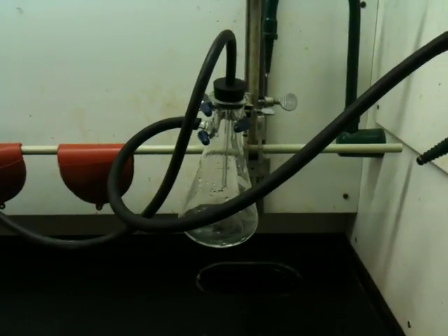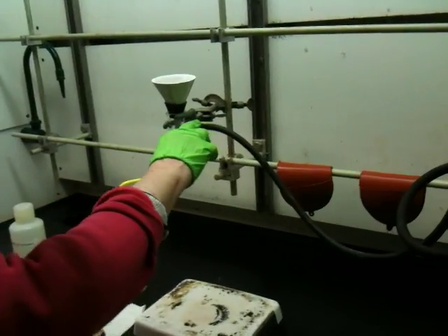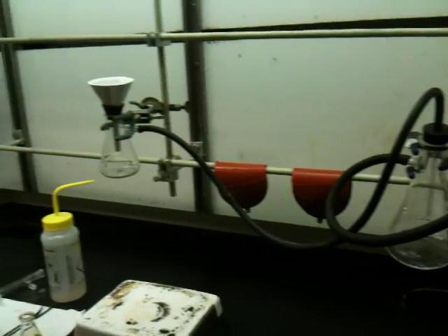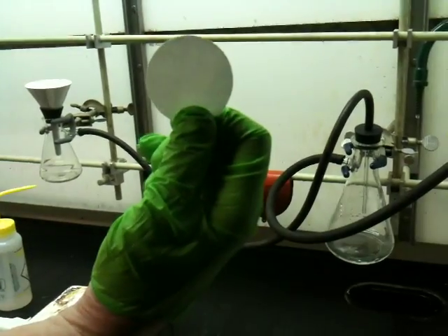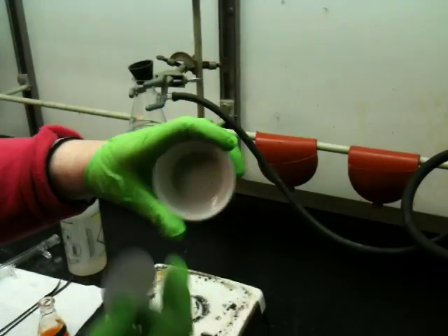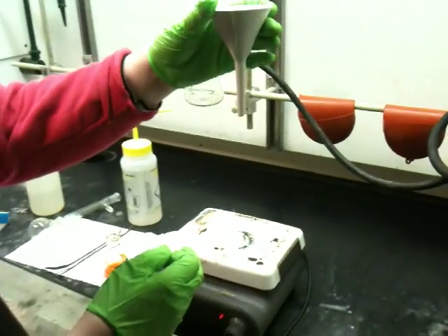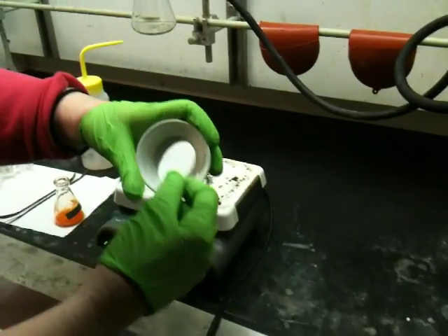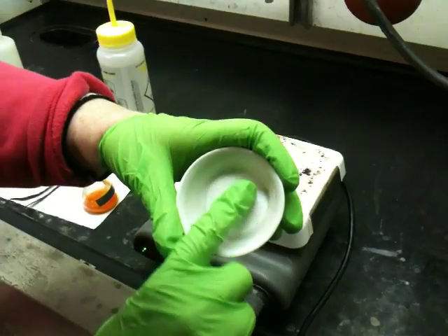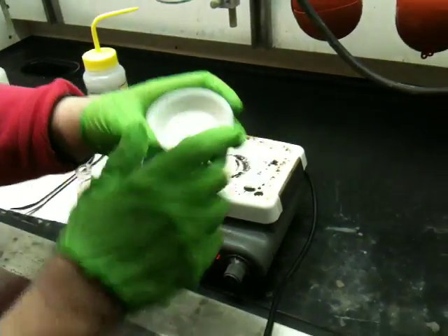I have a vacuum filtration apparatus set up with a trap. We put traps on because we don't want any backup liquid or vapor to go into the system and end up in the vacuum pump. When you do your vacuum filtration, you should use your medium-sized Buechner funnel or Hirsch funnel. The triangular funnels are Hirsch funnels. The paper you put in should only just cover the holes — you do not want the paper lapping up around the sides.